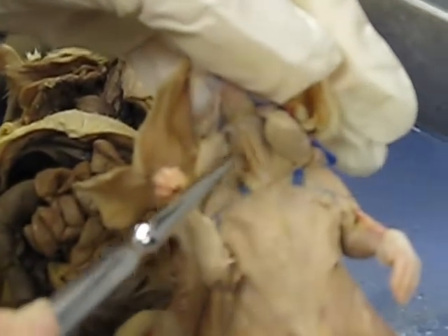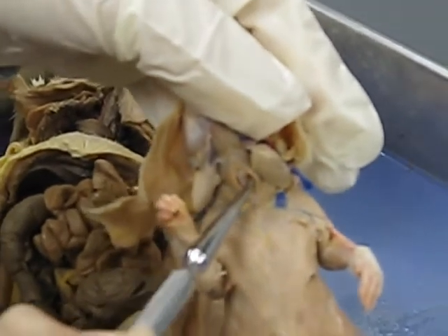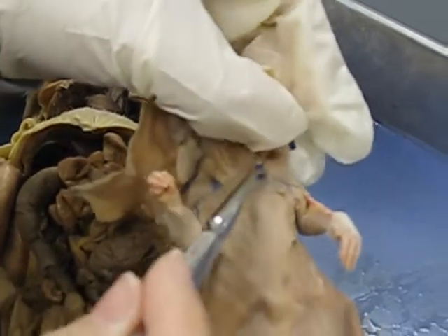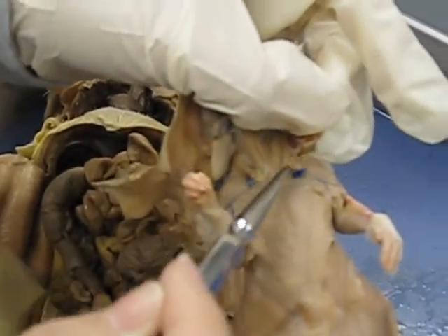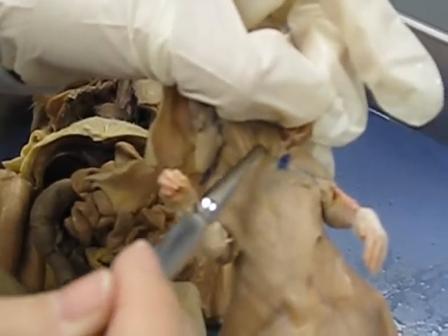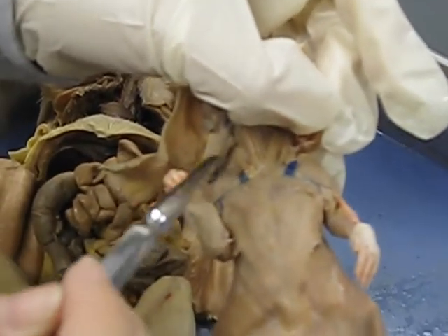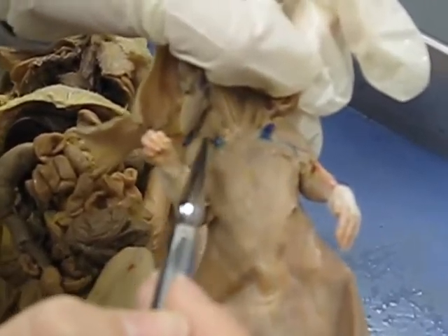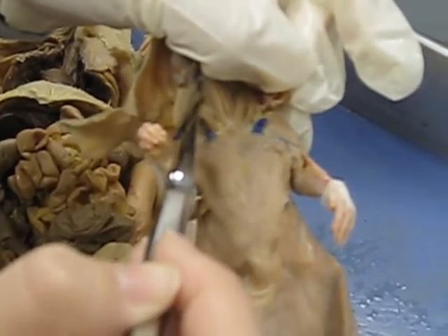Running along the center, below the digastric, you have your sternohyoid. There are two of them, and if you separate them, you can actually see the trachea in the middle. Then you have the sternomastoid, which runs along the side. On the outside, the sternohyoid is in the center, sternomastoid is on the side, and then this is the kleidocervicalis. The kleidocervicalis and the sternomastoid are parallel to each other.